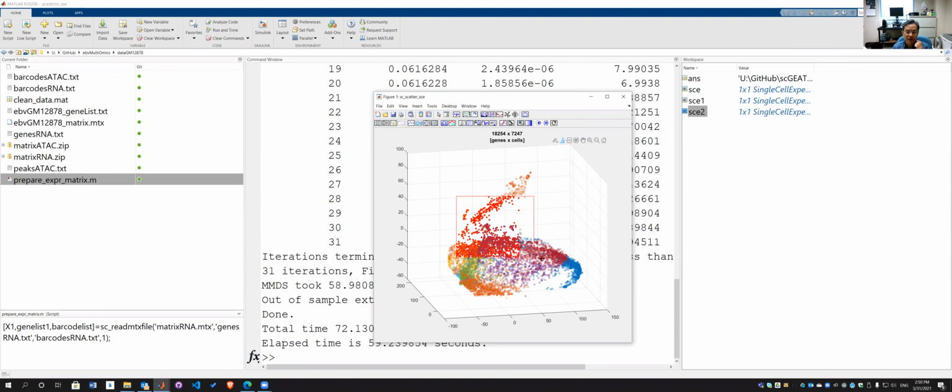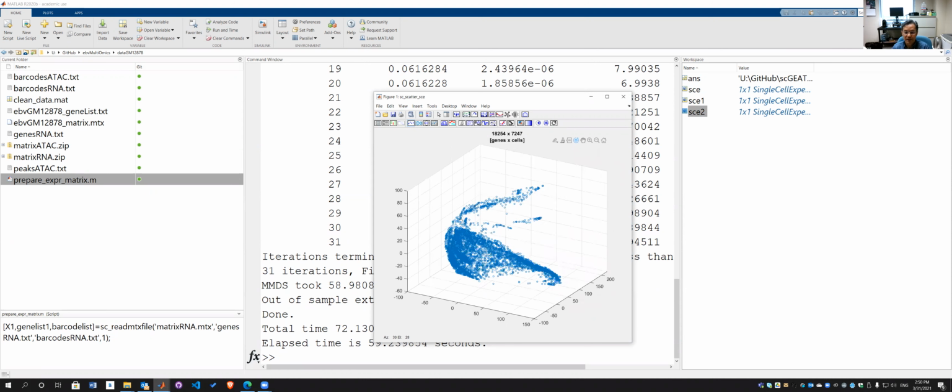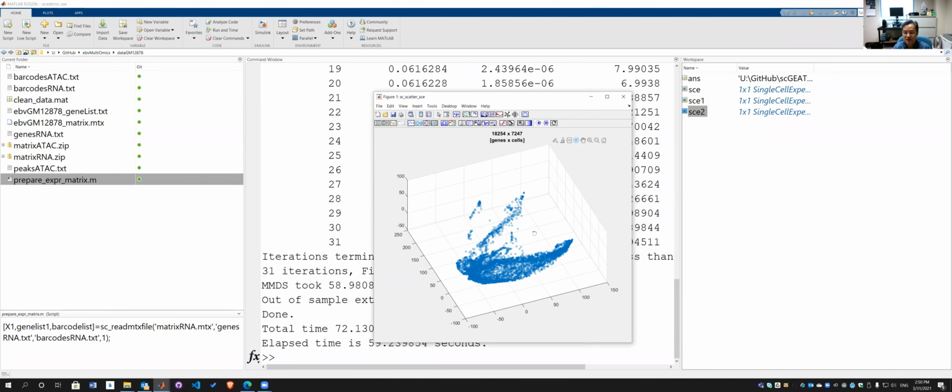You know what I can do is I certainly can merge all the cell types into one cluster, and then merge that again. Okay. So I use merge because it doesn't make any sense for my data set to make subgroups, because they are all LCL, they're all the same cell type. So I just merge everything into one cluster.